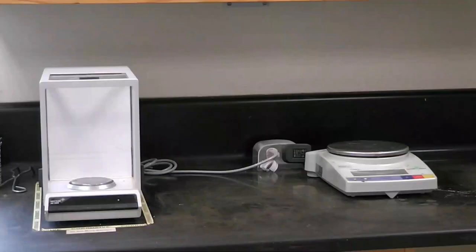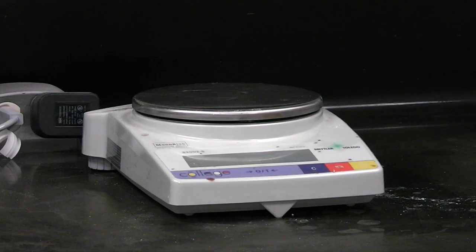These are the two types of balances that you encounter throughout the year: the analytical balance on the left and the top loading balance on the right. The top loading balance can be used to measure much heavier objects than the analytical balance, but does not have the same precision.